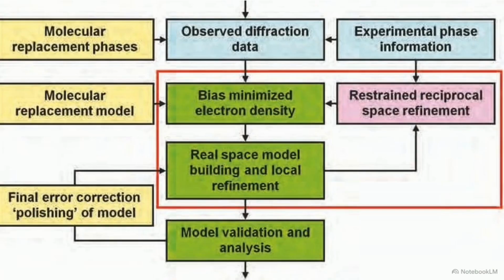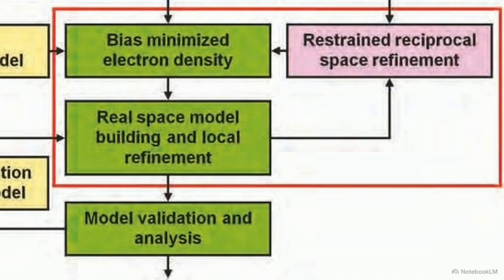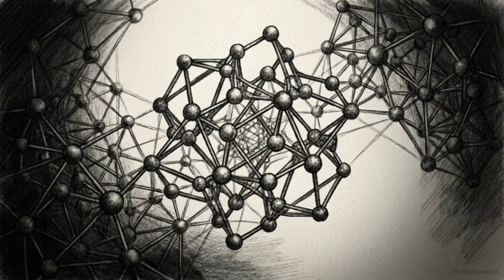Returning to the refinement pipeline. This is the engine of discovery. Real space maximum likelihood mapping to break bias, reciprocal space parameterization to fix geometry, and cross-validation to ensure truth, repeated iteratively until convergence. The process ends with a crystallographic maxim established by George Sheldrick.